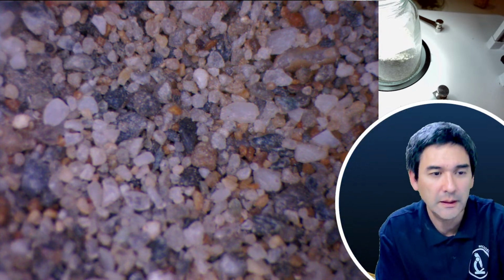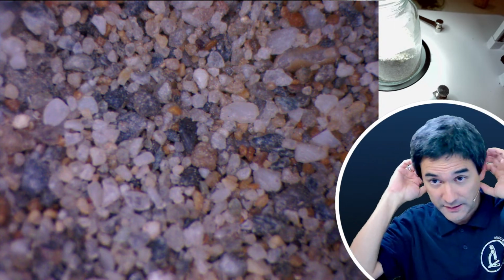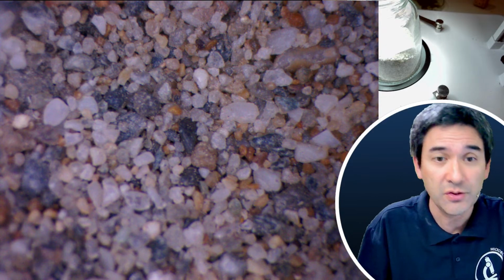So, I am back here with some polarized light filters, which I'm going to also explain to you. So let's quickly have a look here.